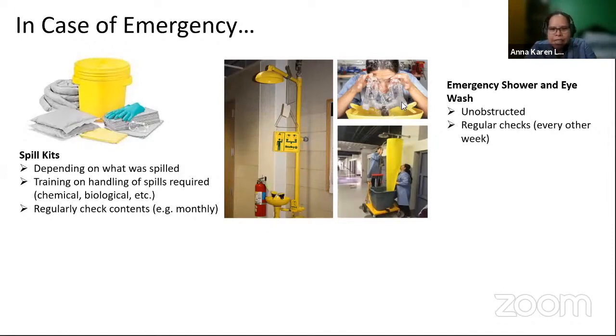And of course, the eye wash goes straight to your eyes and the water is pressured. So you have to make sure that the outlet of your eye wash station is always clean, with no dust or foreign matter stuck on the outlet of your eye wash. That is important. Otherwise, you will blind the person using the eye wash.